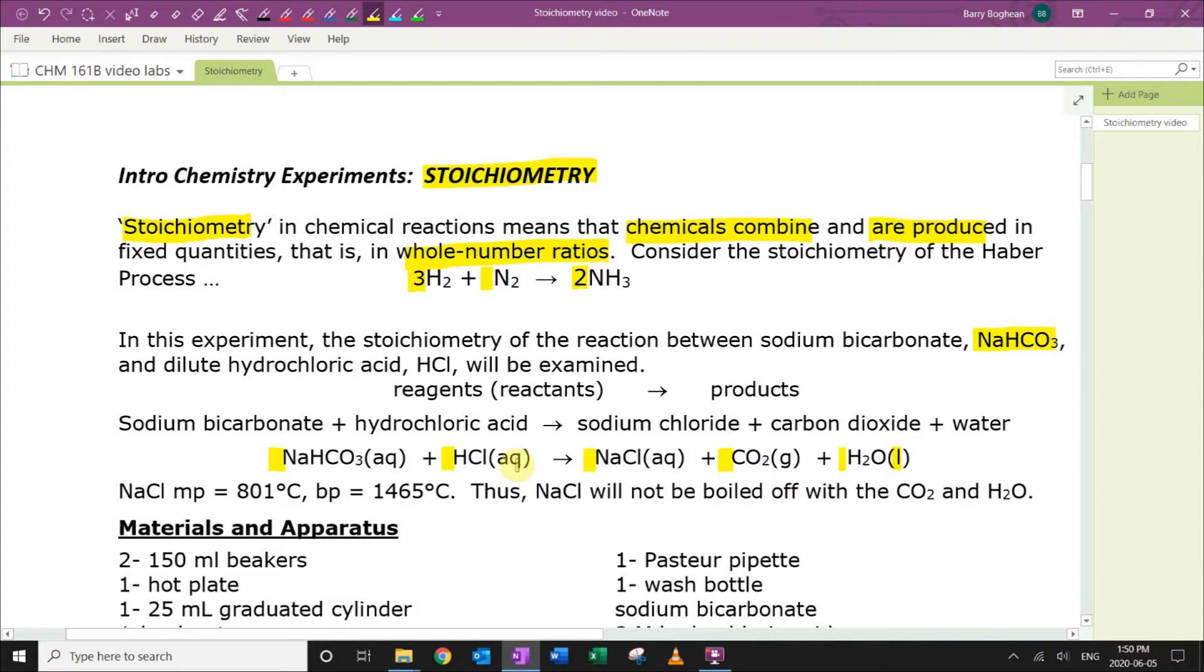Now, we'll heat this up, and the heating will drive off the carbon dioxide gas. The water will be boiled off, and the small excess of HCl will also be boiled off, so we'll only have sodium chloride left.